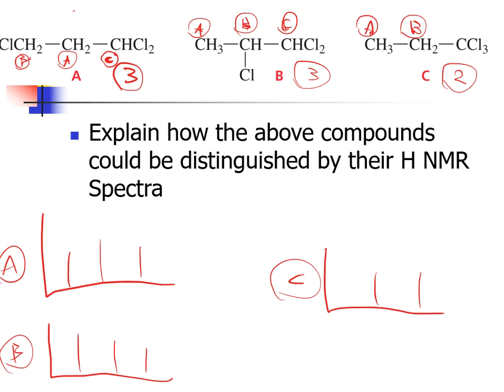And then NMR is a little different. NMR is going to look at these and say, well, I don't really care about functional groups. I don't really care about mass. I only care about the way the protons are ordered up in the molecule. What is the actual structure? What is the order, and how many of them are there? So that's where NMR comes into play.